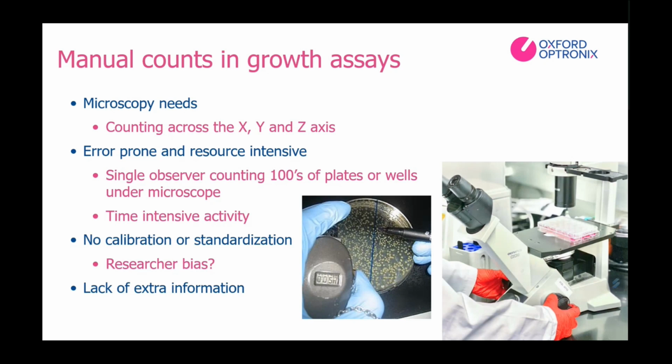Further, since organoids are grown in 3D space, this requires a researcher not only to be methodical across an X and Y axis, but they must also be wary that the Z axis must also be considered as not to miss a substantial number of organoids at differing levels. None of this is particularly easy to do in 3D space. Do note, this requires a highly trained individual, as it's not a particularly simple task, and overlapping objects are almost impossible to count. Regardless of a counter's efficiency, this will inevitably be an extremely time-consuming responsibility.